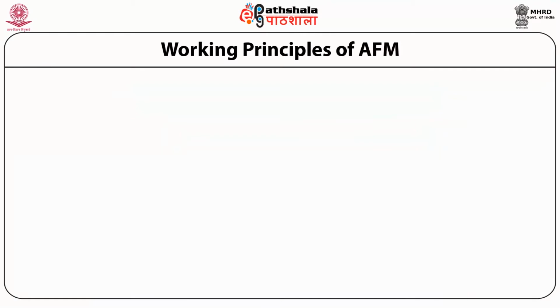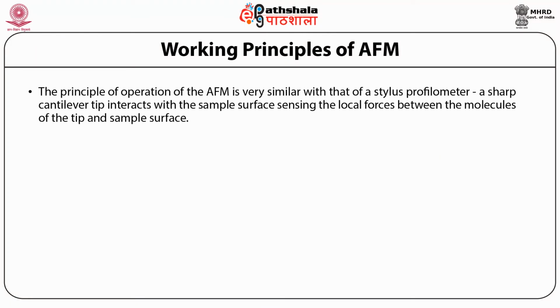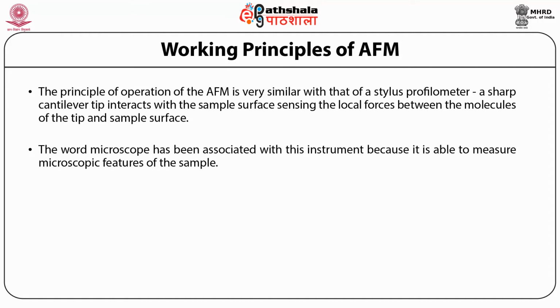Working principles of AFM. The principle of operation of the AFM is very similar to that of the stylus profilometer. That is, here a sharp cantilever tip interacts with the sample surface, sensing the local forces between the molecules of the tip and the sample surface. As shown in this figure, this instrument is not a conventional microscope that collects and focuses light. The word microscope has been associated with this instrument because it is able to measure the microscopic features of the sample.